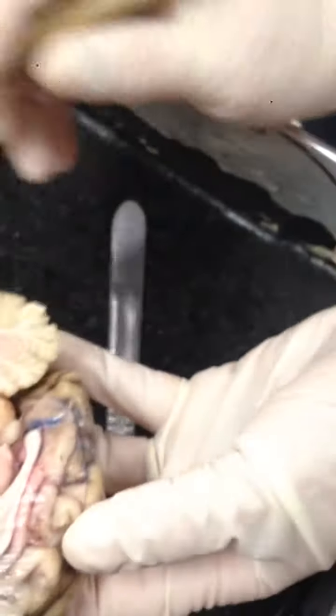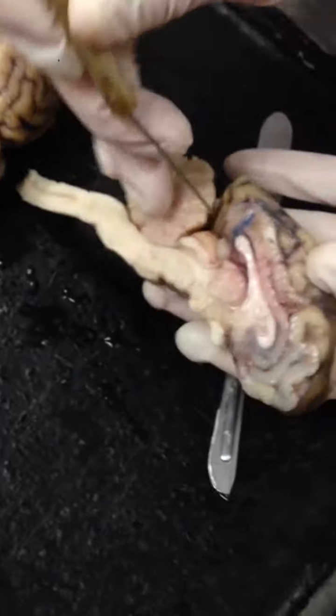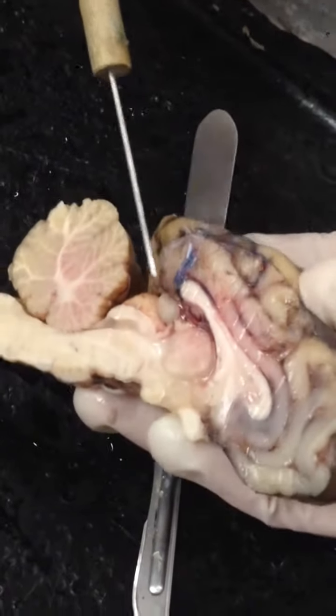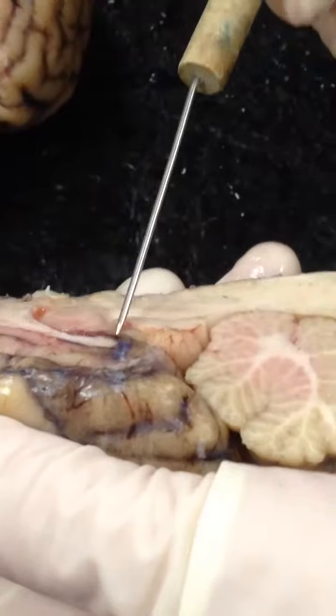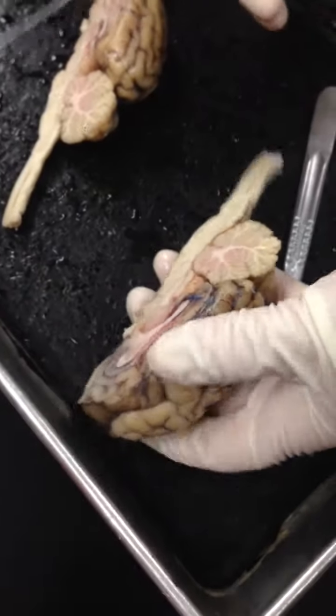No, one more. Remember the corpora quadrigemina, all right? I showed you it from the whole. You can see it from the side as well. And above it was what? What was that little ball above it? The pineal gland. All right, you also can see from this view. So you have the corpora quadrigemina and the pineal gland. Okay? All right, that's what you guys need to know.